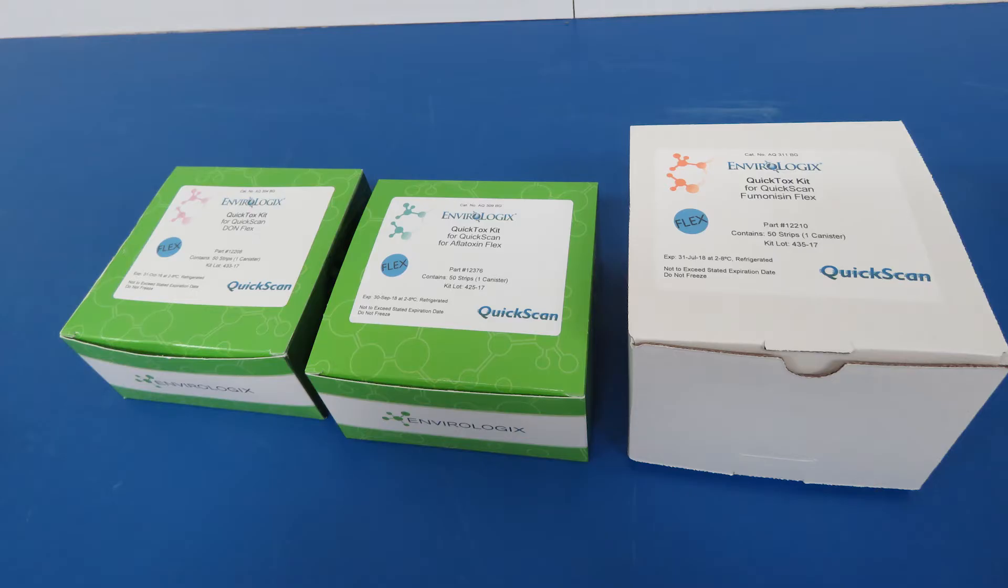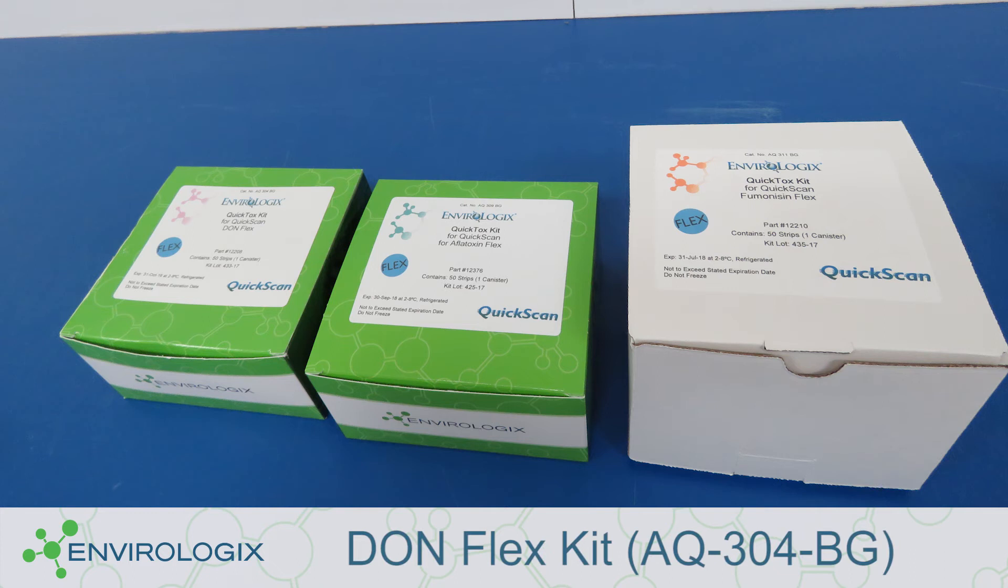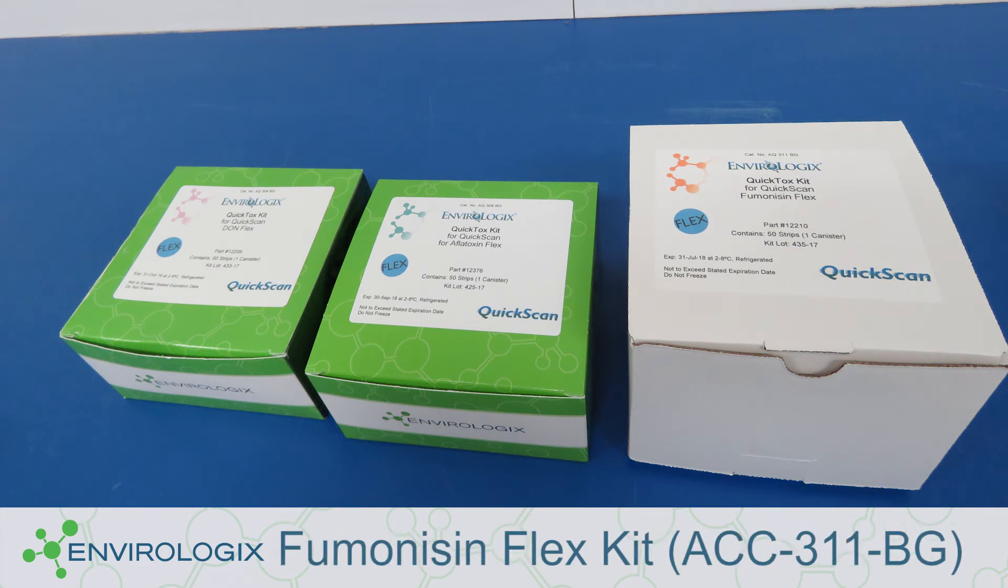The common extraction protocol is designed to run with any combination of the following FLEX mycotoxin testing kits: DON Flex, Aflatoxin Flex, and/or Fumonisin Flex.